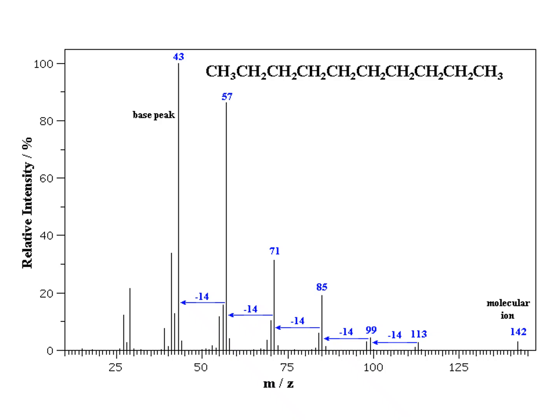The thing about a mass spectrum is that it is a fingerprint, and every element or every molecule has a unique spectrum that it will create based on its unique fragmentation and mass to charge ratios, etc. Now we've simplified it where we assume that the only mass to charge is a +1, and that makes our life a lot easier. But a lot more will happen in your mass spectrometer that we do not need to focus on at this level, which is why you will find that some of these peaks, we're not going to try to identify them.